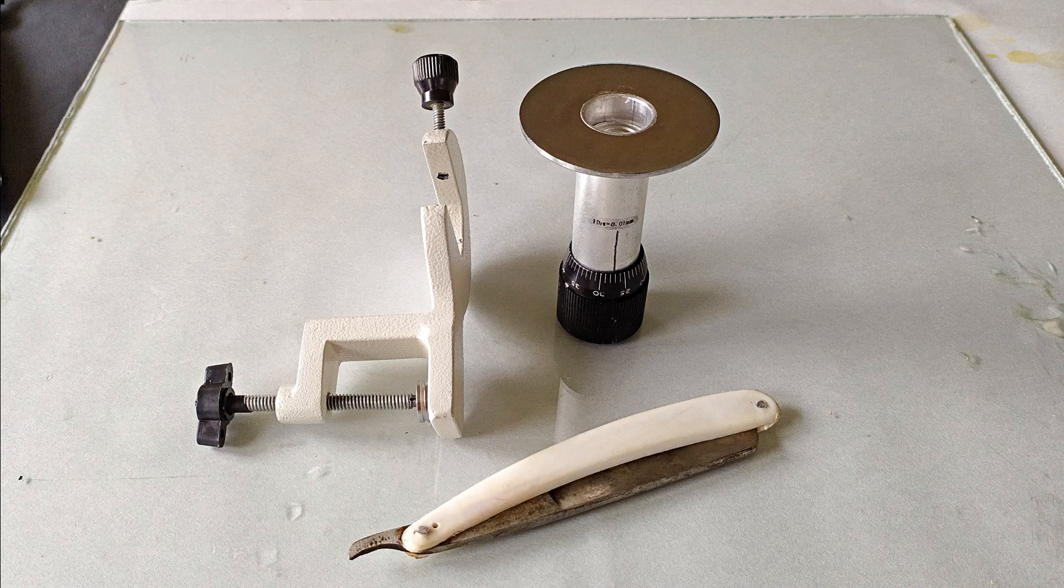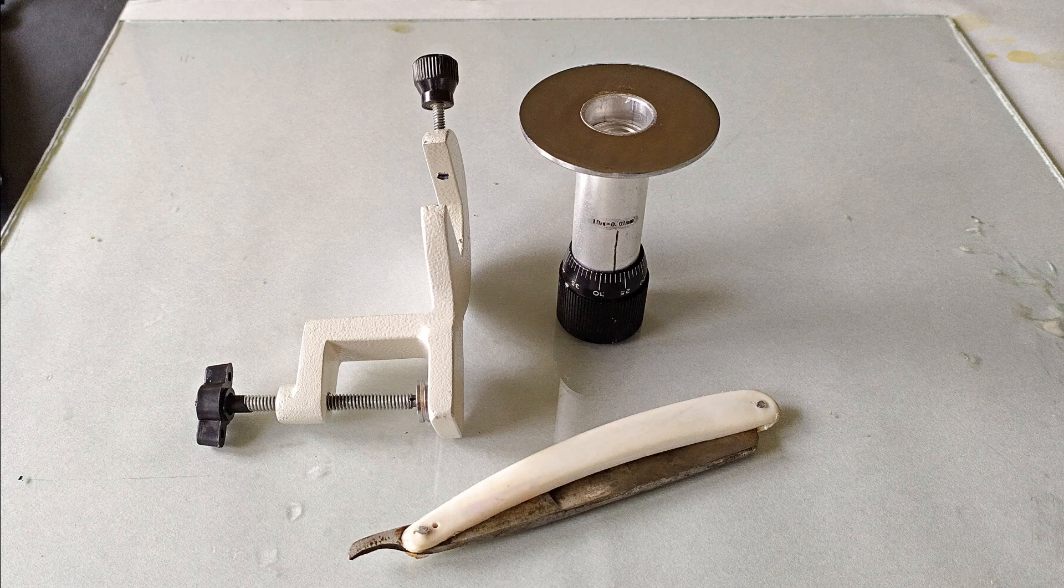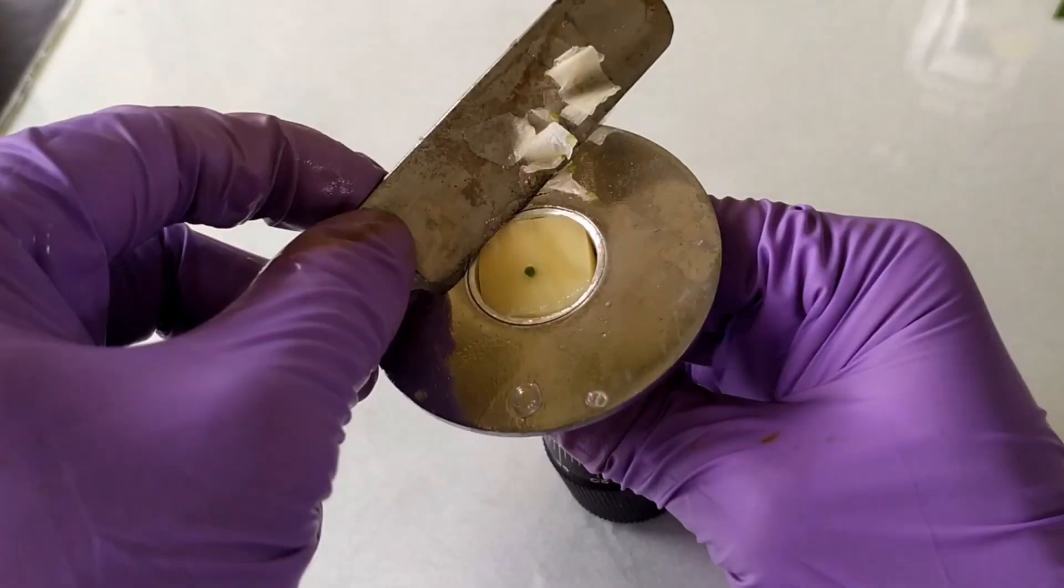Now once you have prepared and placed the sample in the sample holder using any one or a combination of the previously discussed techniques, proceed with the section cutting. To do so, first turn the graduated knob anywhere between 10 to 20 divisions and then start sectioning the sample. To section the sample, place the razor blade on one corner against the sample at an inclined position of about 10 degrees to the sectioning platform.